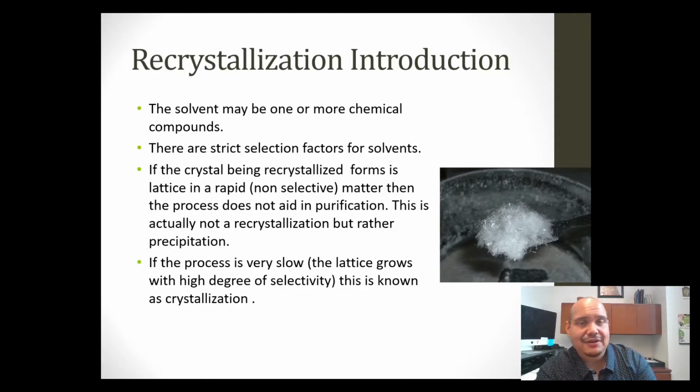It's not to say that it's totally polar or totally nonpolar. It's only to say that this is going to work for your compound. If you're told, however, that you need to figure out which is the best solvent for this particular crystal, then you would need to do basically your own version of the solubility test that we already did in week 1, and test each of the solutes with varying different solvents and keep going until you find one that works. That's how you would select an appropriate solvent if you weren't already told which one to use.